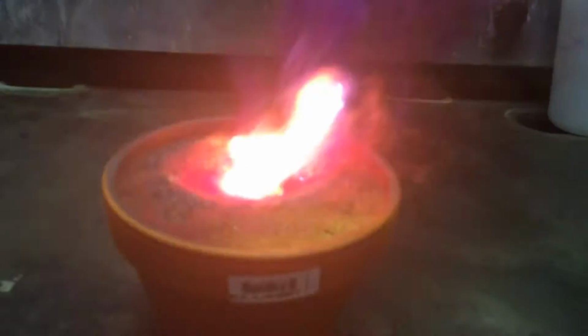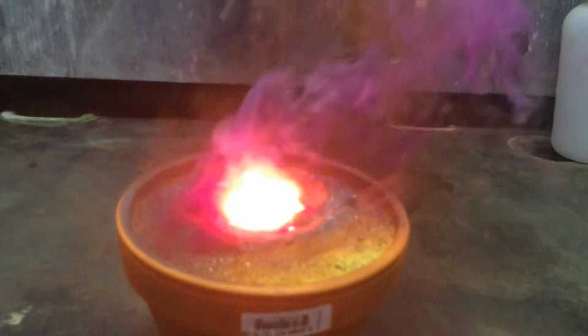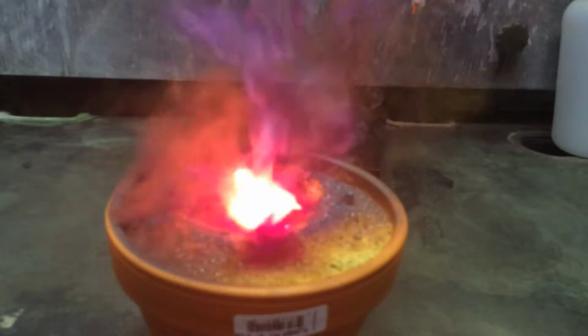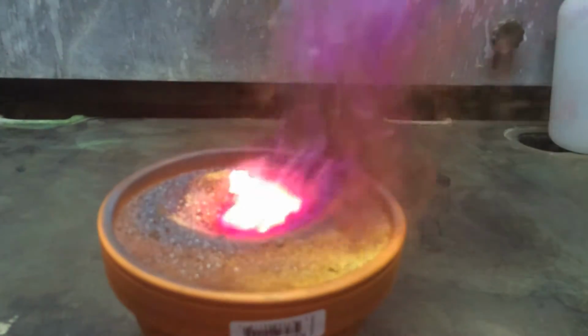This is something we can't do in a lecture hall because of the iodine gas that's produced. Iodine is toxic in gaseous form. It's not as bad as chlorine gas, but we don't want to put it anywhere near students.